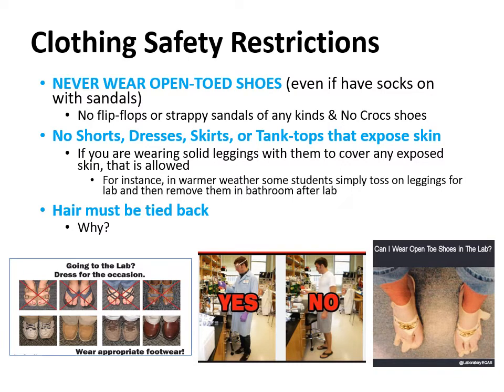Now, we also have a lot of clothing safety restrictions, because even though you are wearing a lab coat and gloves, if you're wearing the wrong kind of clothing, you end up putting yourself at risk as well. So the first big rule is never wear open-toed shoes, and that means even if you think, oh, I have socks on, that's fine. No, you never want to wear open-toed shoes.